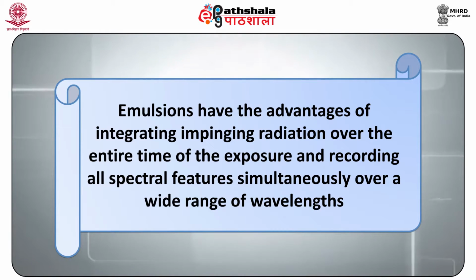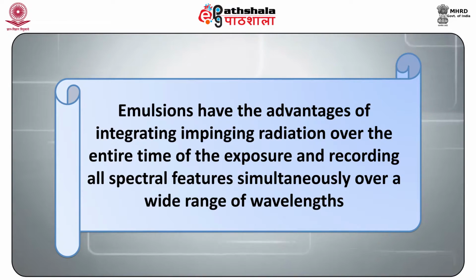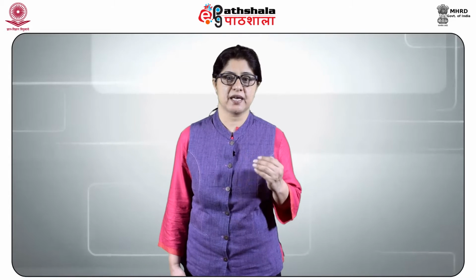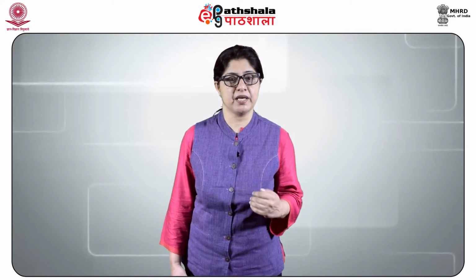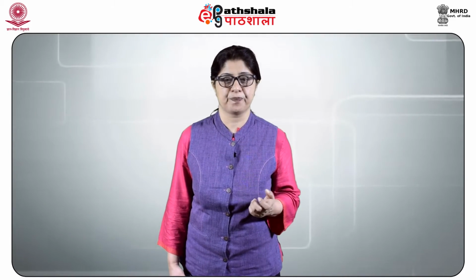Emulsions have the advantage of integrating impinging radiation over the entire time of exposure and recording all spectral features simultaneously over a wide range of wavelengths. These characteristics allow weak spectral lines to be detected by using long exposure times, and they also provide a relatively inexpensive means of obtaining permanent records of emission spectra.